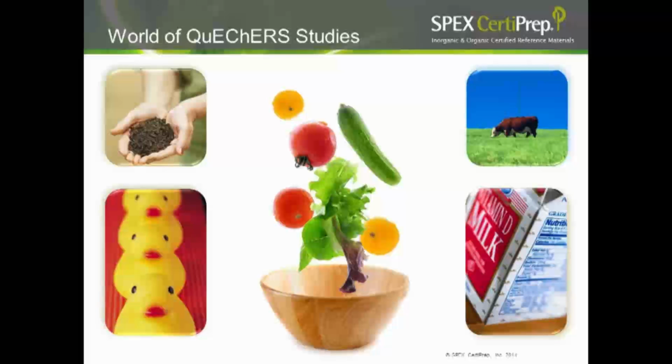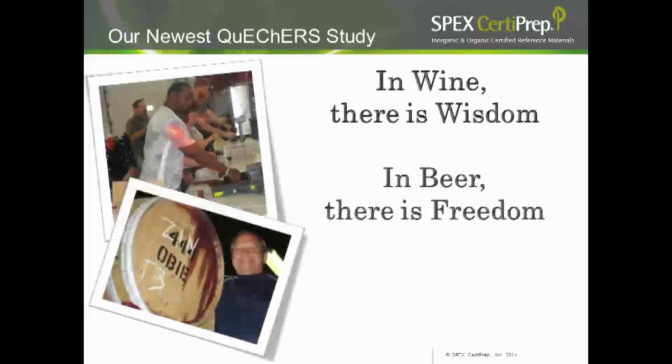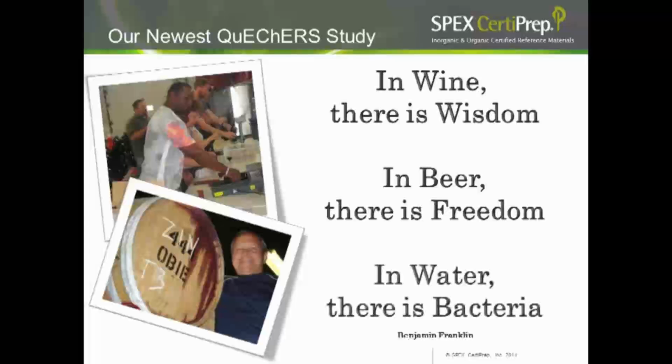So when we were looking for a new project for our QueChERS, we looked to our company and we looked to our previous studies and tried to decide on a product that we could look at that was near and dear to everyone at SPEX CertiPrep's heart. For our newest study, you may have attended one of our previous webinars on the art and chemistry of wine. We decided that wine and beer would be the perfect opportunity for us to test our high throughput methods for QueChERS. Because as Ben Franklin said, in wine there is wisdom, in beer there is freedom, and in water there is bacteria.